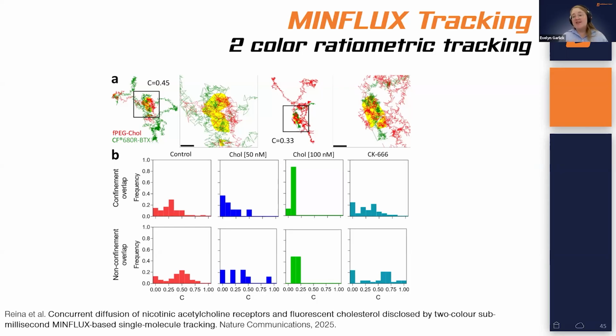of the membrane. So they were able to see the behavior. In this case, they were looking at picket fence models. They were looking at corralling and the adjustment of behavior in different sort of membrane subdomains of this tagged cholesterol and a tagged receptor protein.